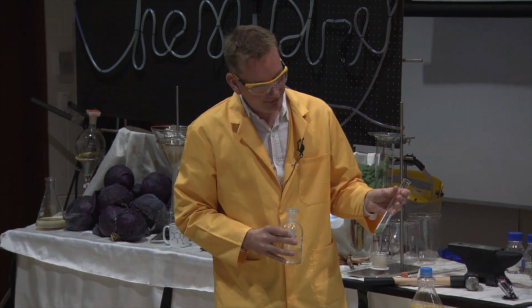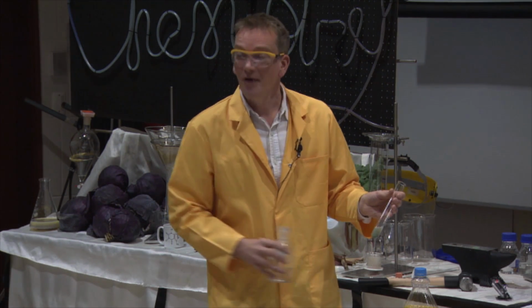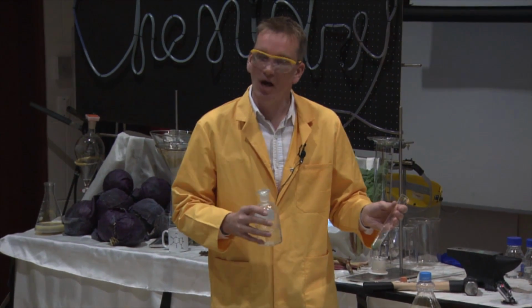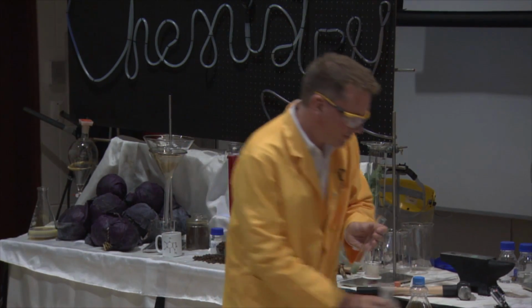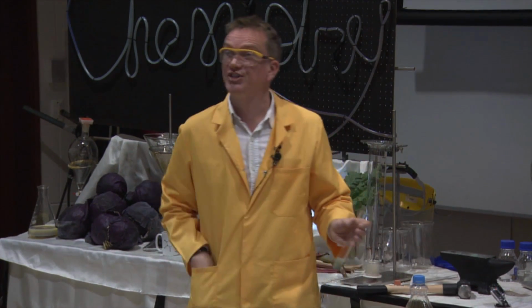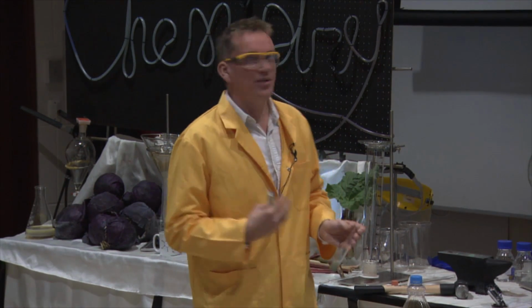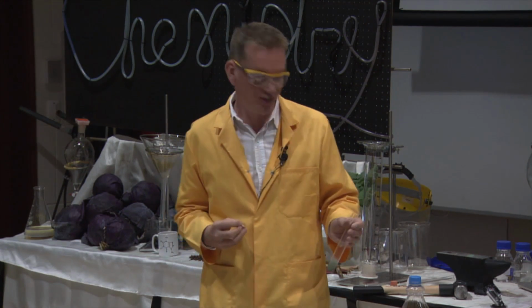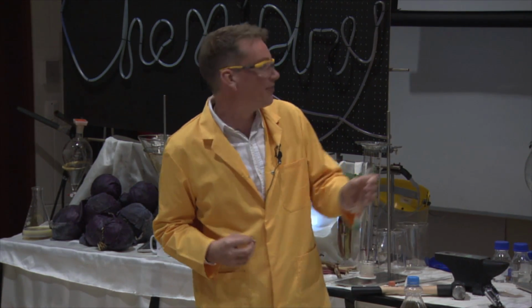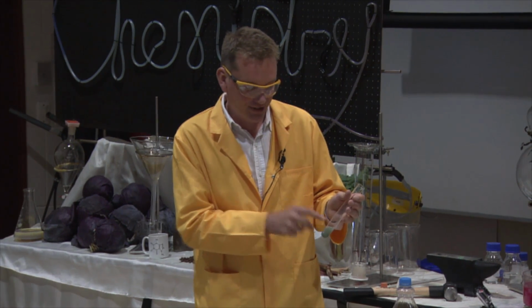Well, it is beginning to fizz. You can see little bubbles coming out here. This is as our mineral, the copper carbonate, is reacting with the acid, and this is driving out some of the carbon dioxide. Again, we could write a chemical reaction for this. This is the copper carbonate reacting with our sulfuric acid, and what we're making here is copper sulfate, and this will have a nice bluey colour eventually, but we're driving out the bubbles of carbon dioxide gas.